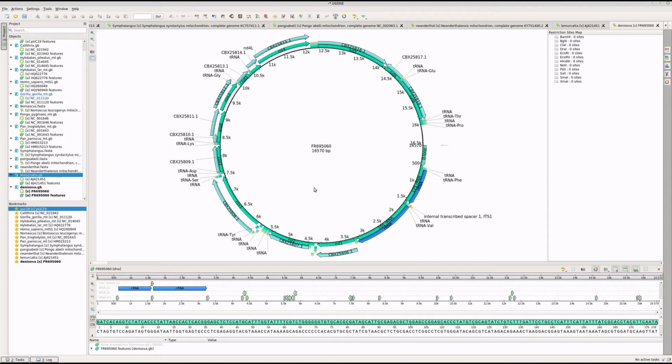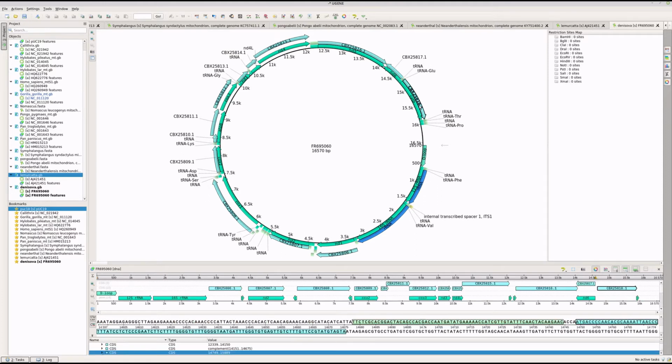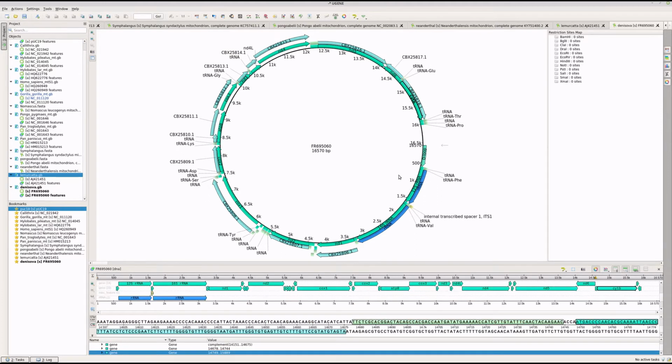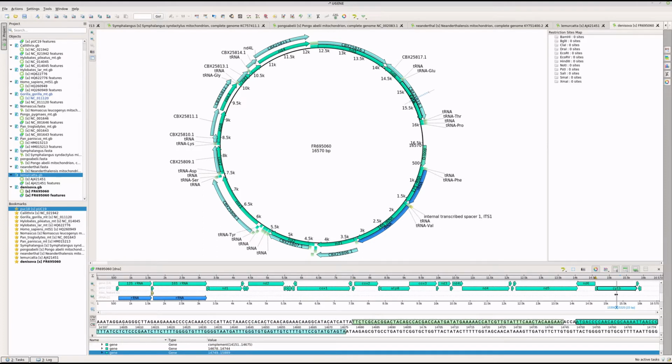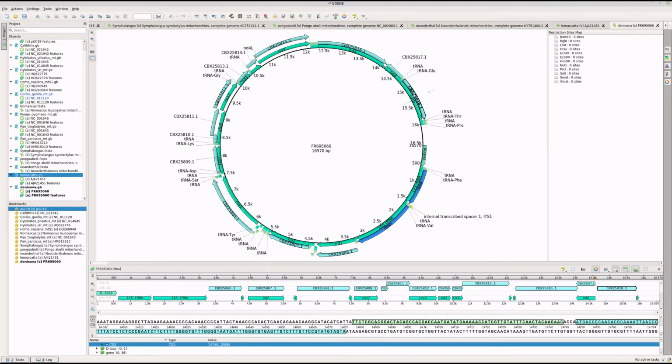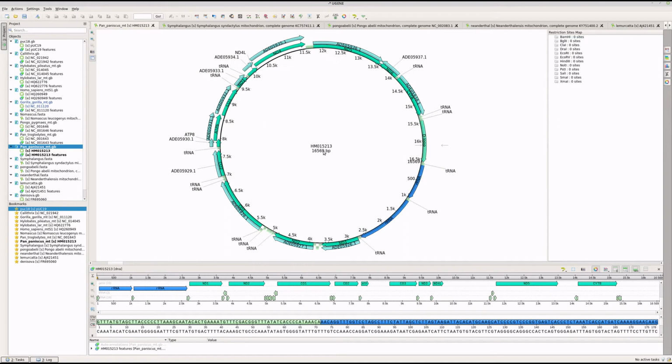Yep, so that's all those things. You can see the annotations of these, and you can see that sometimes they have two annotations, right? Sometimes there's something that's an actual gene-like name, like site B, and then you can see here an accession number that you can find on NCBI, right? Let's see this one. Yeah, this one also does the same thing. You can see that they're all about 16,500, so 16.5 kilobases.